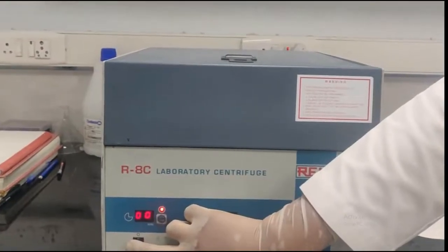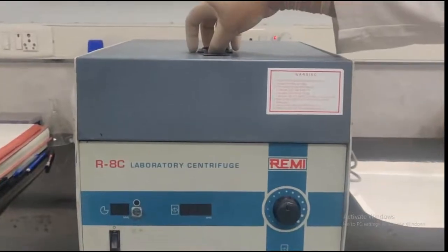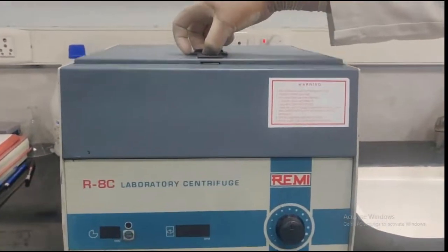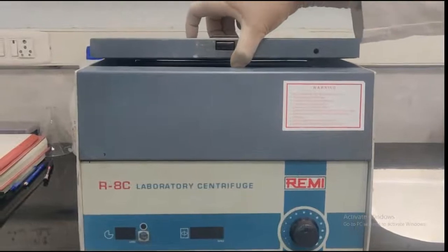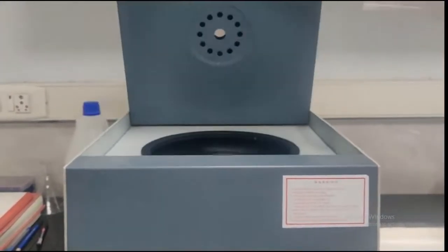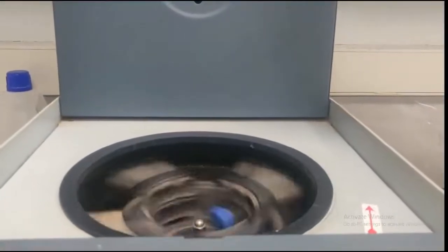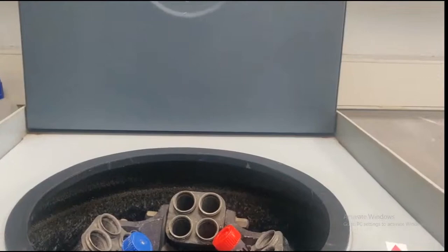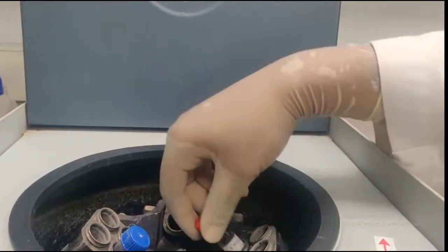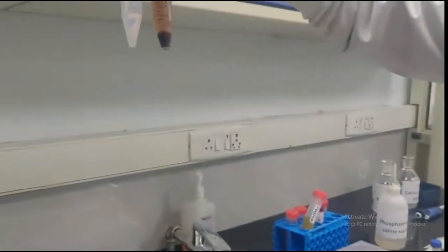So now the centrifugation is over. So now we'll gently open the centrifuge lid. Wait for the motion to stop. Now we'll take out the tubes. You can see nice pellets have formed at the bottom of the tubes.